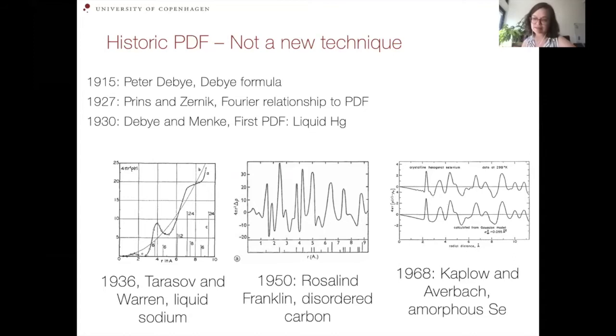a broader scientific community has used it, because at this point it maybe wasn't worth as much. It was a lot of struggle to get a PDF, and maybe it didn't contain all that much information, because you had low computer power, and the facilities, the scattering neutrons and the x-rays that were needed, weren't really available. But we have that now.